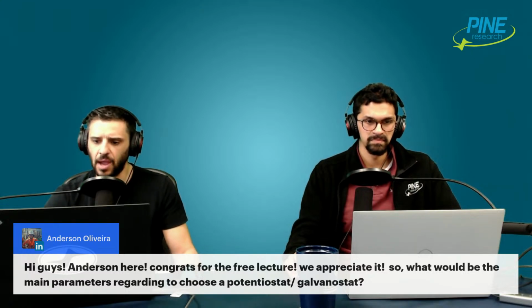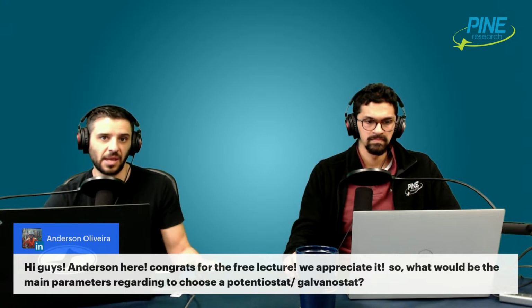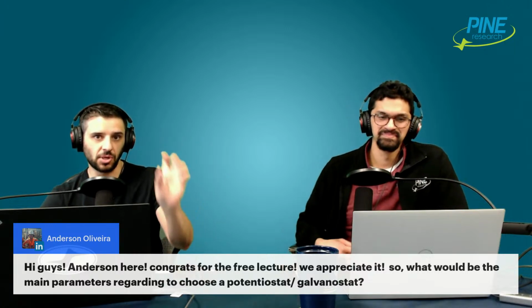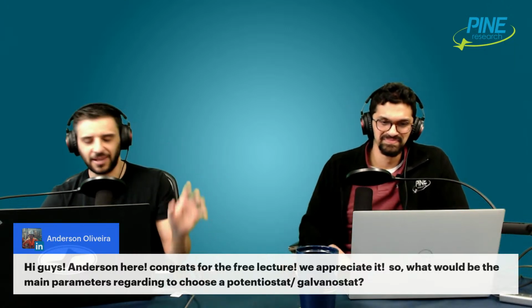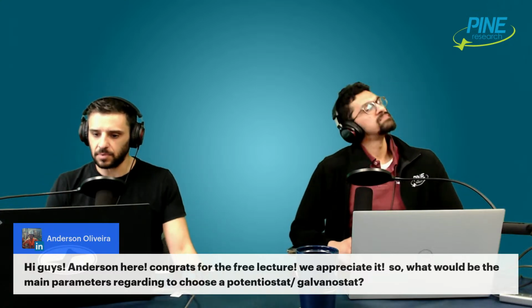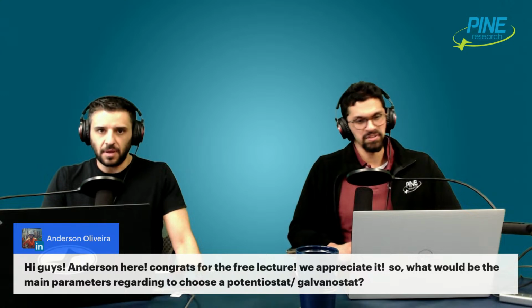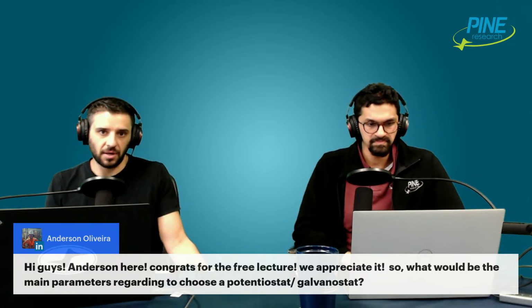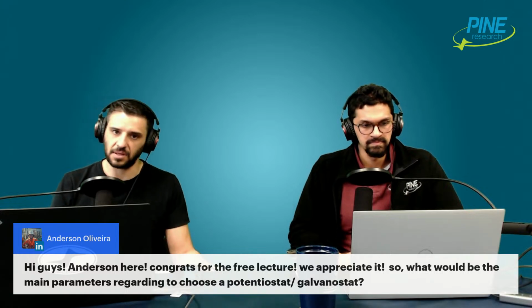What would be the main parameters to choose a potentiostat or galvanostat? So the number one is, is it made by Pine? That's a yes, no Boolean. So if the answer is no, you don't buy it. No, I'm just kidding. Honestly, it depends what you're doing. Of course. The main things, I mean, potential and current limits are the most fundamental thing to be looking at.